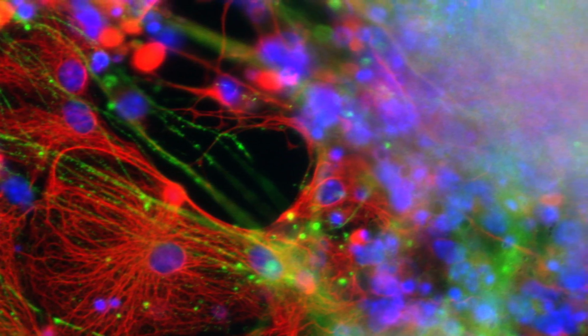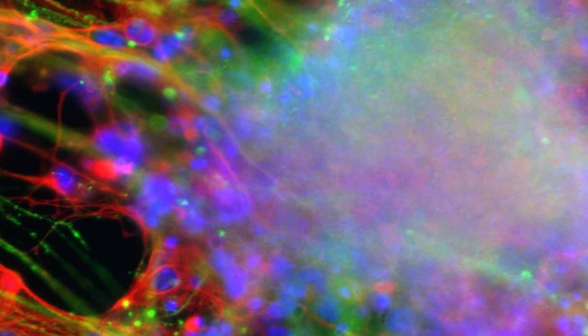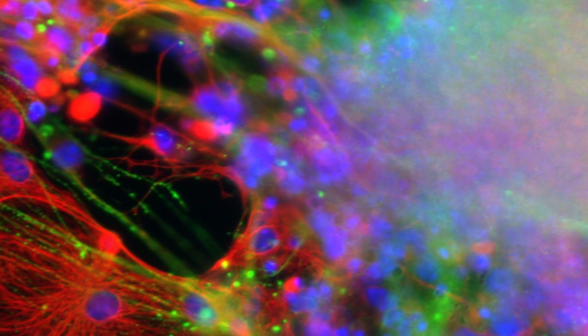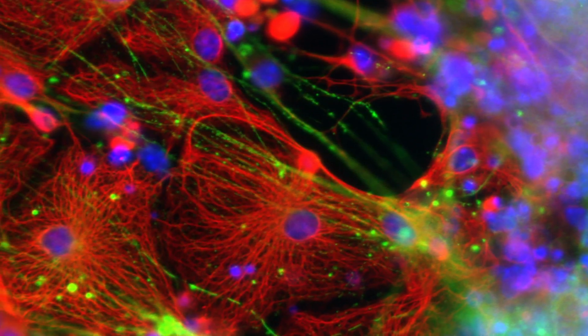So in the image, the fuzzy cluster on the side is the remnants from the embryoid body, where you see a lot of blue staining, where each blue dot is a specific nucleus of a different cell. And emanating from the embryoid body are different cell types. So in the green, you'll see axons of mature neurons, and in the red, you'll see staining of mature astrocytes, which have differentiated from the embryoid body. This is interesting to us because, as I mentioned, we see differences in sensitivity when you lose the AAG protein in stem cells compared to neurons.